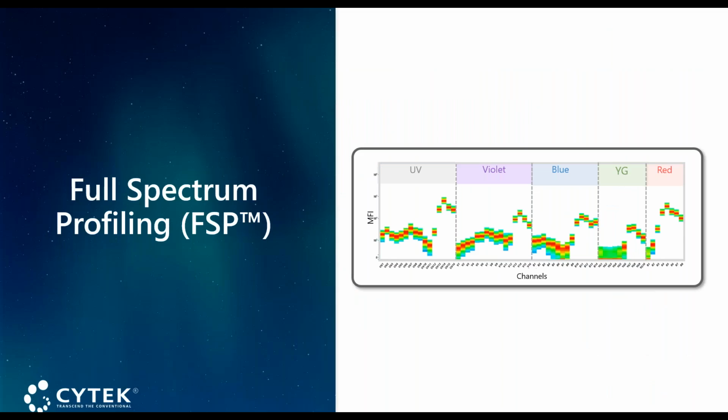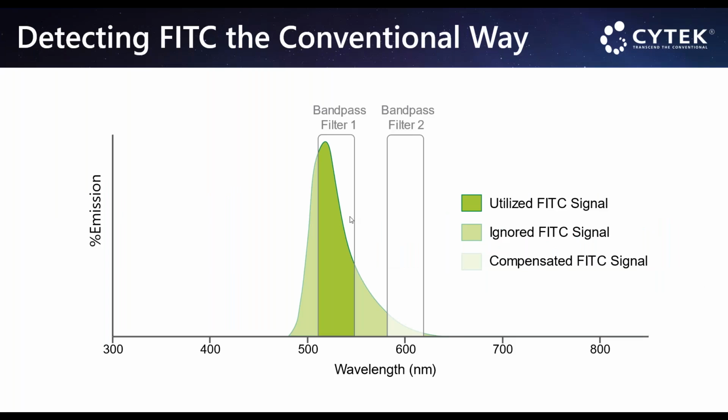And so what is full spectrum profiling? This signature that you see here, if you can see my cursor, is key to understanding what full spectrum cytometry has to offer, and there's a lot of information packed into this one signature.